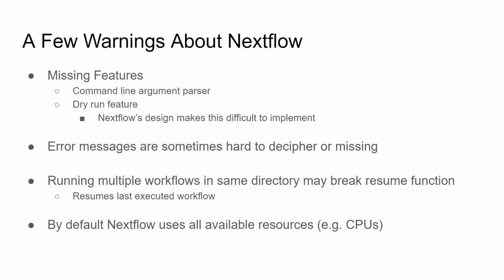And this is one that tends to step on the toes of others. By default, Nextflow uses all available resources. So yes, it has very good support for clusters and all that. But if you're on a shared resource, like some nice little 24 core server or something, and you execute your Nextflow workflow, it's going to use all 24 cores unless you tell it not to. So it's just something to keep in mind. It doesn't do that if you're on a cluster, because if you're on a cluster, you have to say, I want this amount of resources.